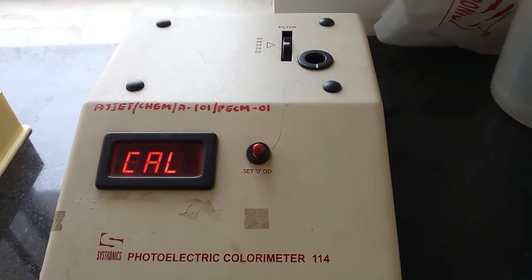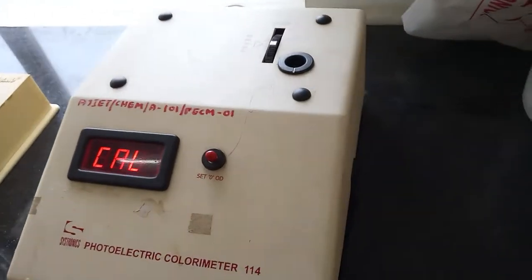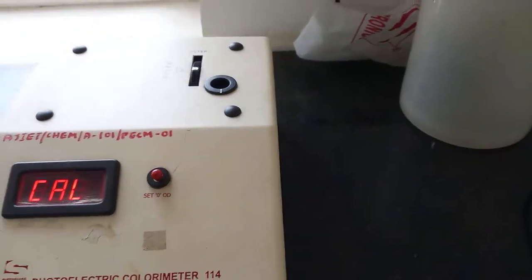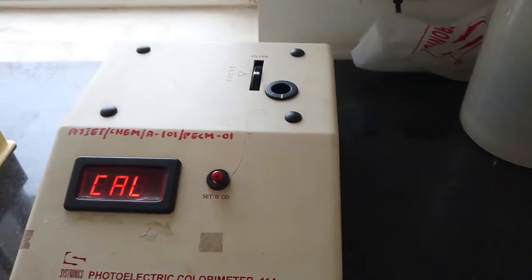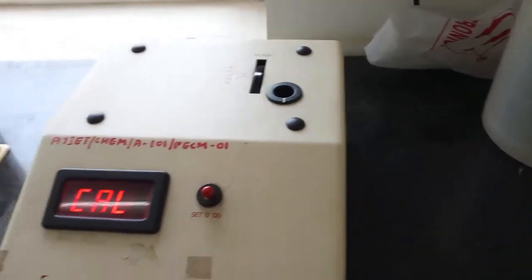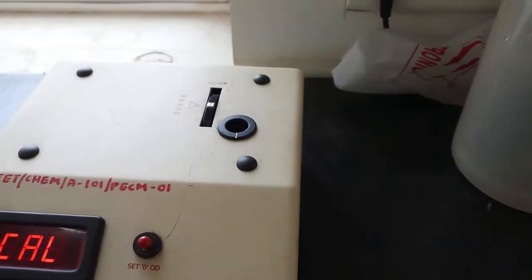The principle is based on absorption of light — how the absorbance depends upon the concentration of the solutions, mainly colored solutions. Colored solutions can be analyzed using this experiment. Copper sulfate being colored, that color can become intense by adding ammonium hydroxide, and this is how we can estimate it.